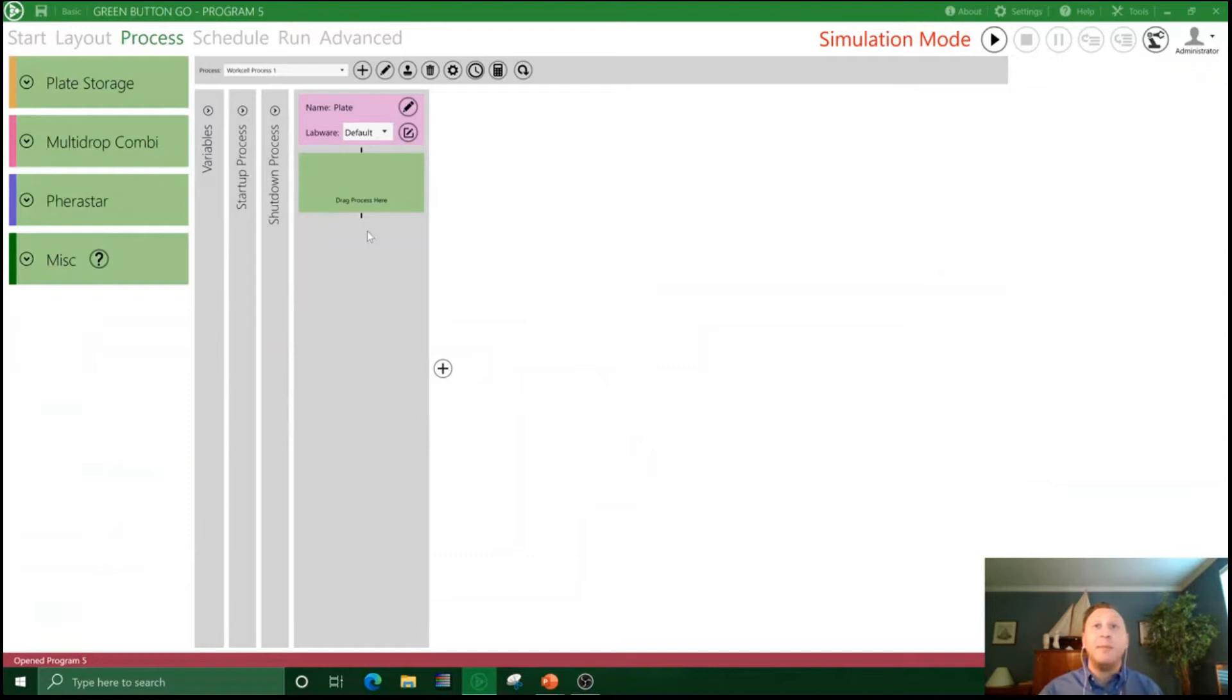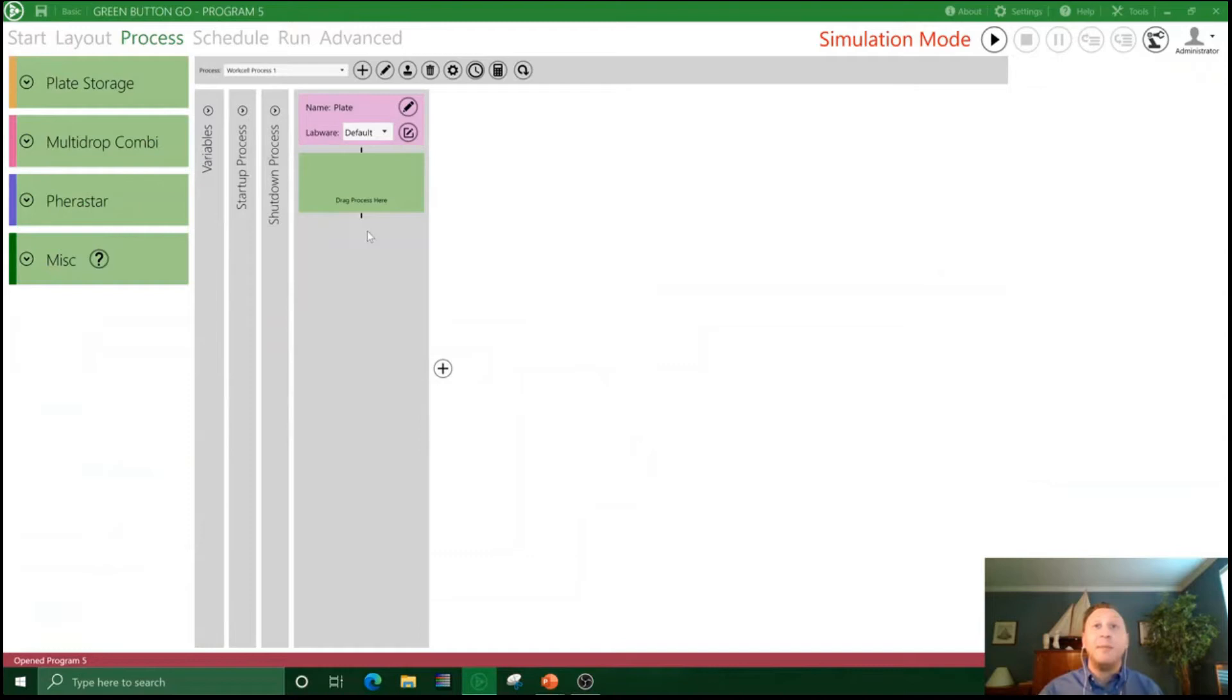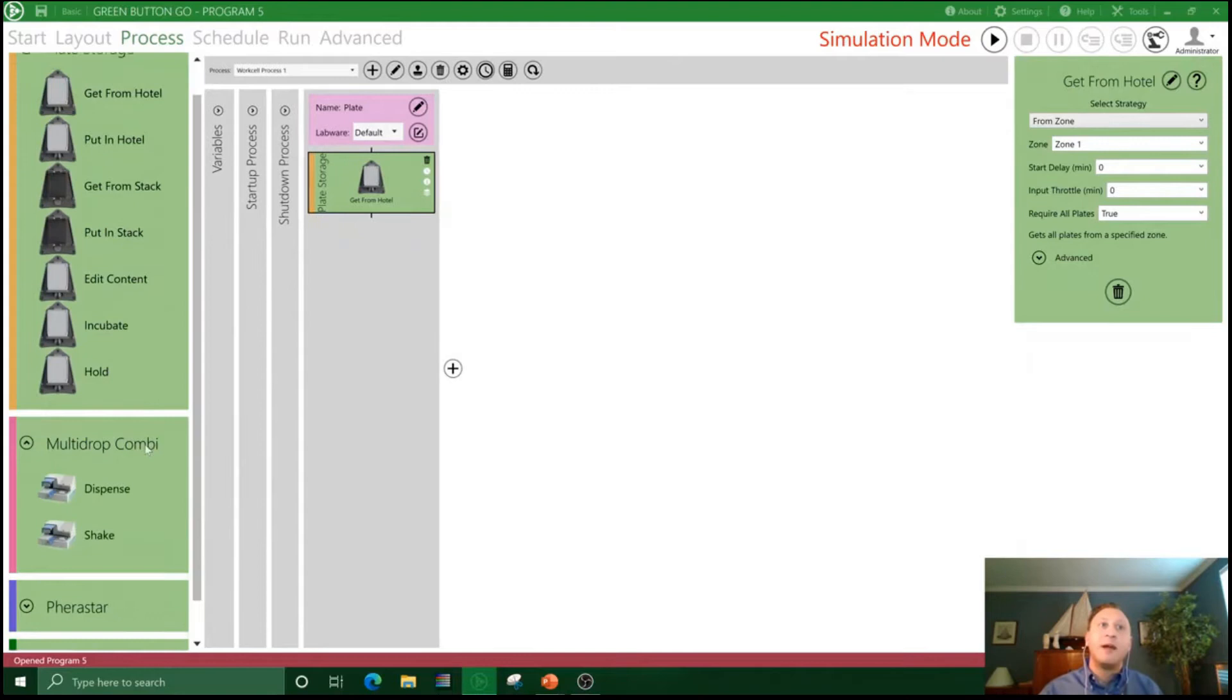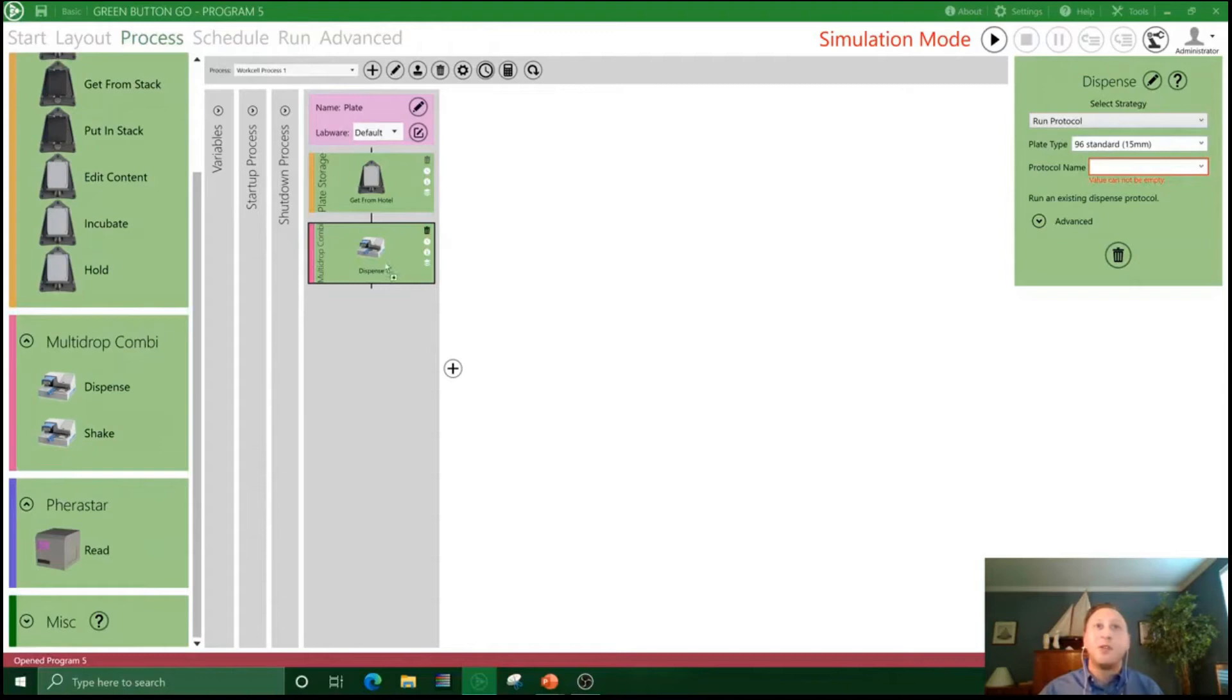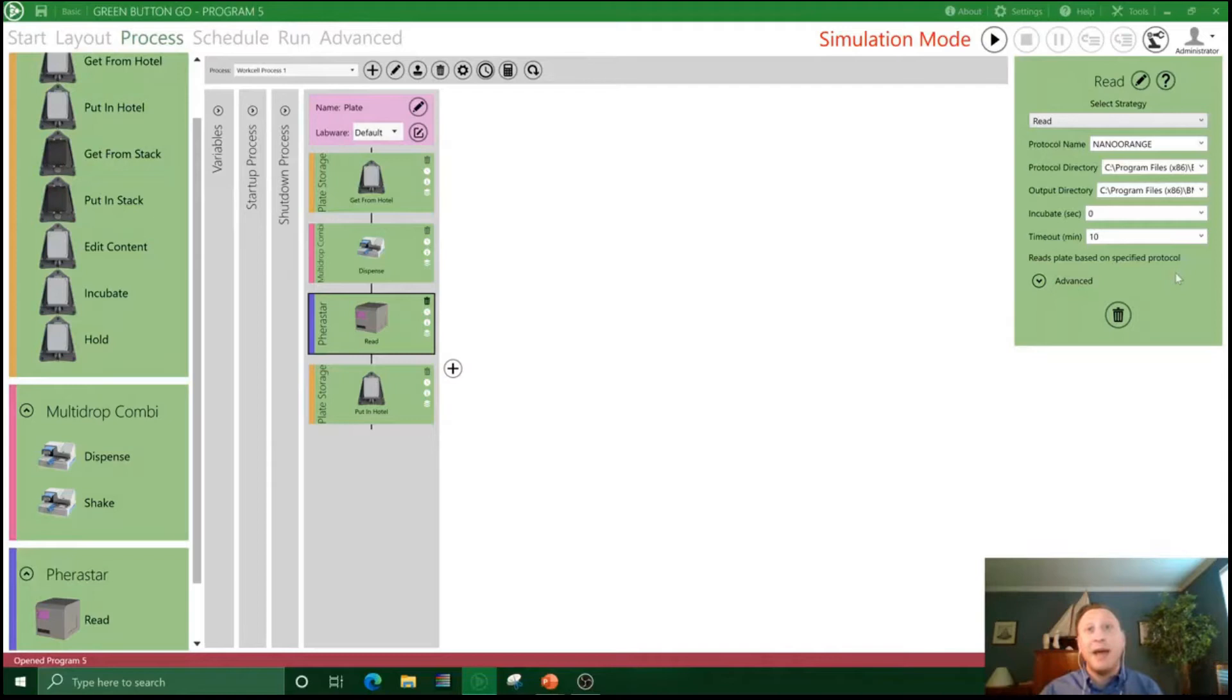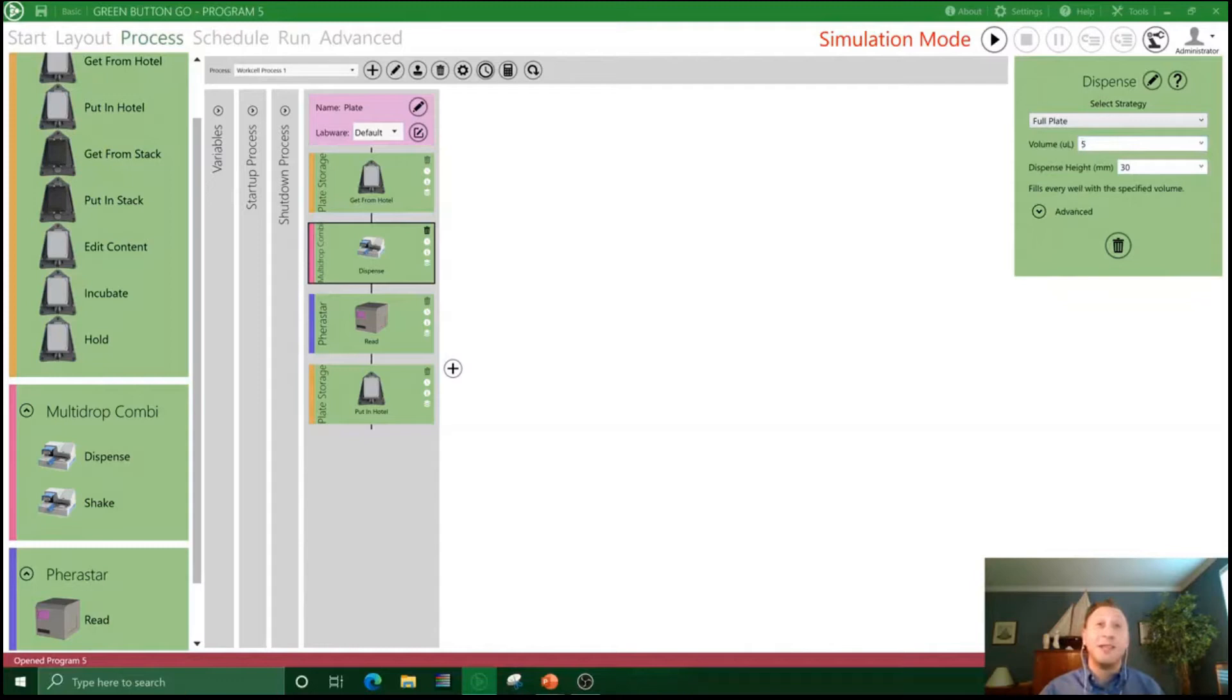Now that our system is configured, we can move into our process tab, and this is where we define the protocol that will be executed on the automation. Here on the right, the instruments that we've added to the system are now available to us. So first, starting with plate storage, we're going to bring a plate out of the hotel. From there, it will go down to our Multi-drop Combi for a dispense, to our Pherastar for our read, before going back in the hotel at the end. All of those configuration options are available to you.